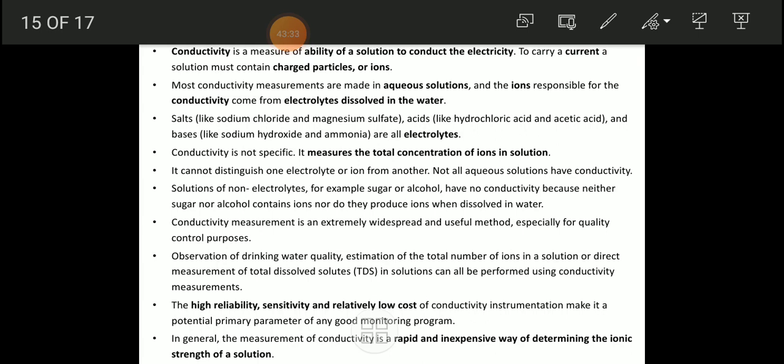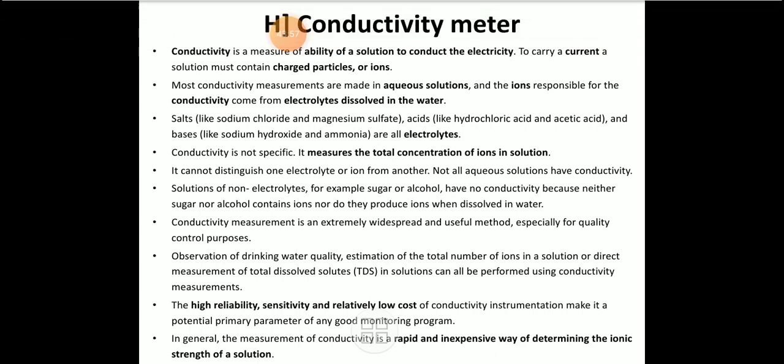The high reliability, sensitivity and relatively low cost of the conductivity instruments make it a potential primary parameter of any good monitoring program. In general, the measurement of conductivity is a rapid and inexpensive way of determining the ionic strength of solutions.